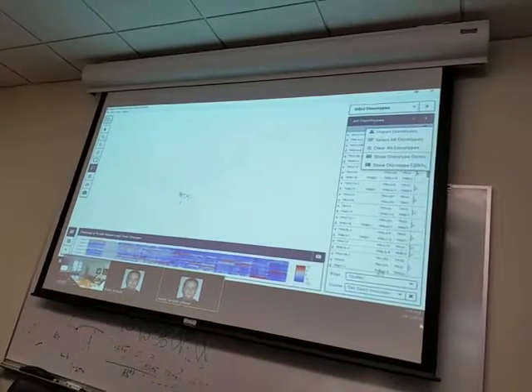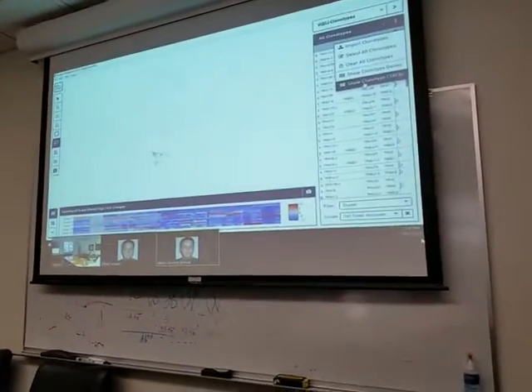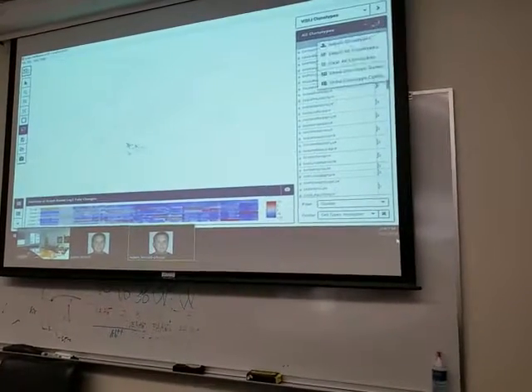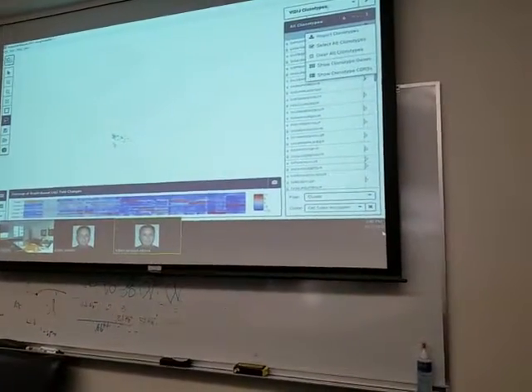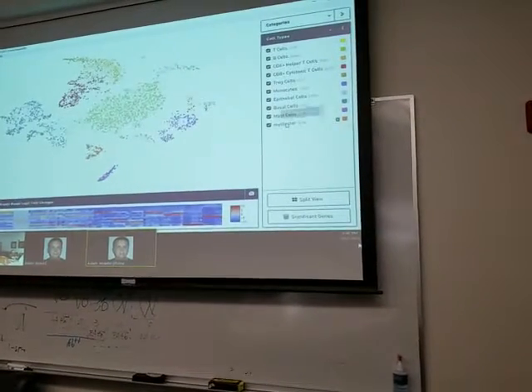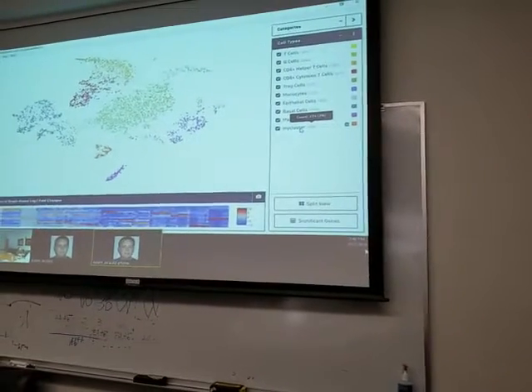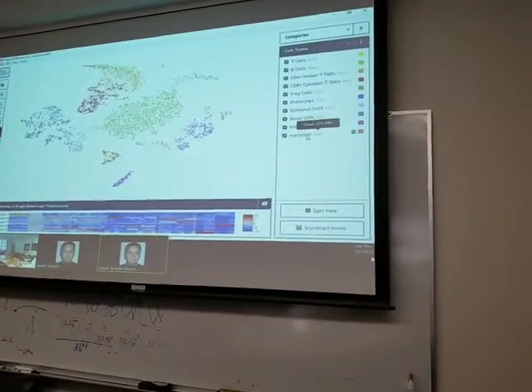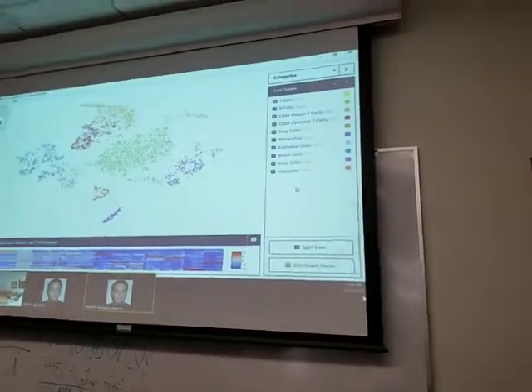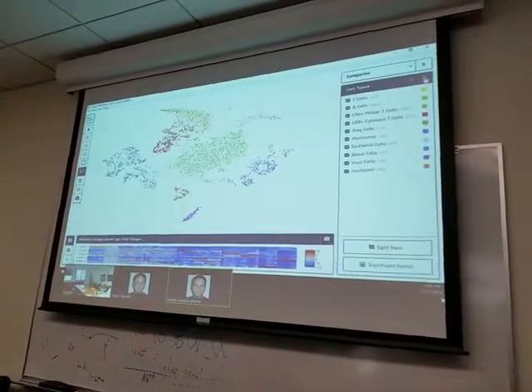Should go to, and then get the barcode. Is that right? Or no? Go ahead. Export what? Well, I'm sorry, we would get the barcodes. We'd have to go back to here where we put it, and that's where we get the barcodes from. I see. And you export that. Now, how do you export it again? I have a bad memory. Yeah, so just right here.